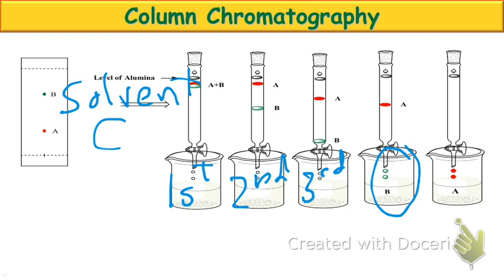We don't want to mix it with compound C. We're trying to limit its exposure to that other compound. There's no sense in us making it more impure by incorporating more solvent C. So is it just water there? That beaker is going to be compound B and the solvent that's still pushing it out. So it is still coming out contaminated, if you will, with your solvent. But it's not as much solvent as if you just collected everything together. We're just trying to limit that exposure as best we can.